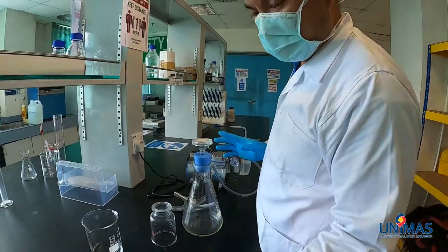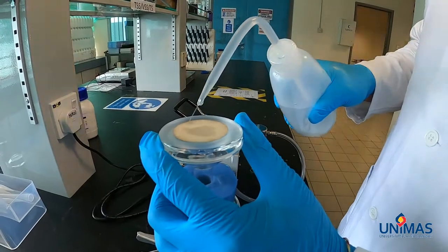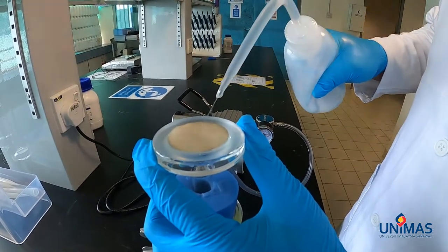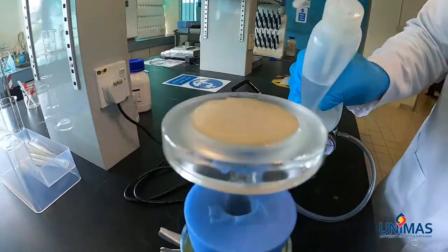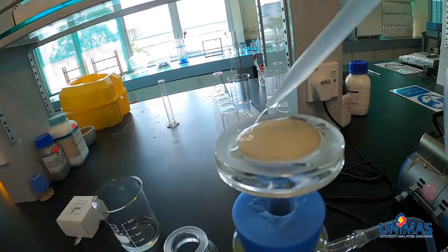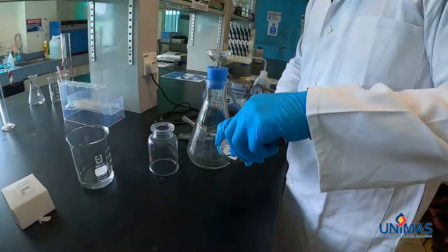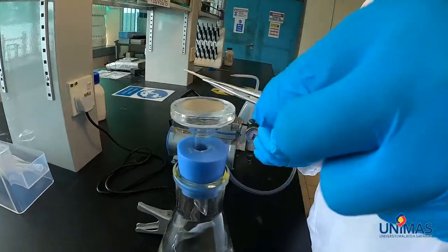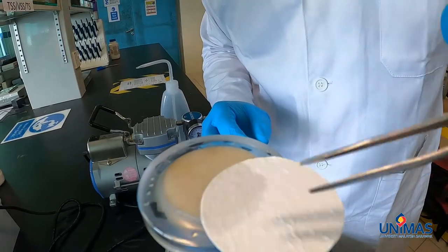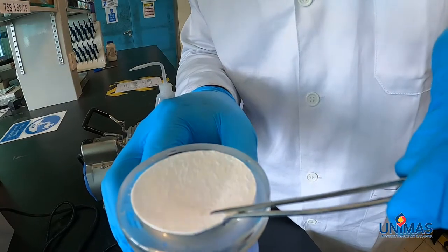First, what we need to do is to wet this disc to make sure that there are no air bubbles being trapped. Make sure the disc is fully covered by a layer of water. Then we are going to place the disc here — this is disc number two. When you want to put on the disc, you need to slide it in from the side to minimize the possibility of trapping air between the disc and the support.